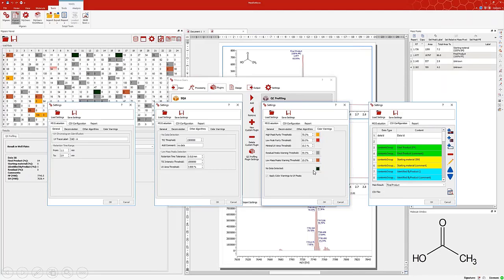This helps you to fine-tune for which wells you want to see a warning because human revision is really needed, and which ones can just be accepted as they are, where human interaction would be nothing else than a waste of time.